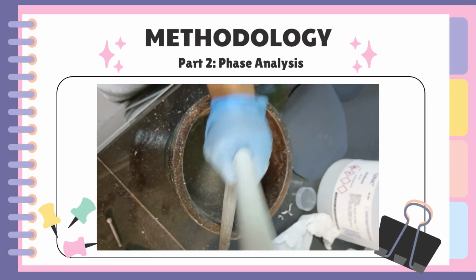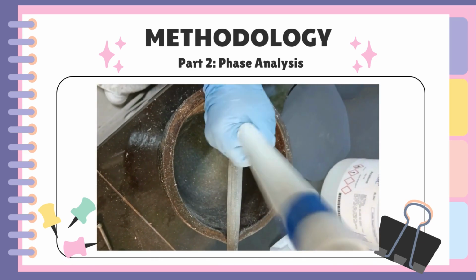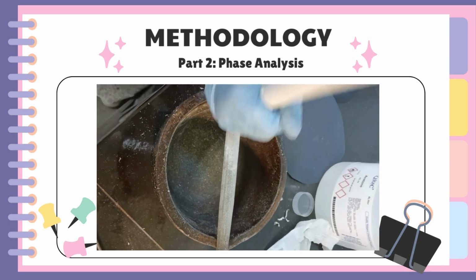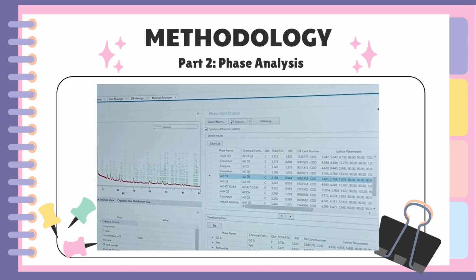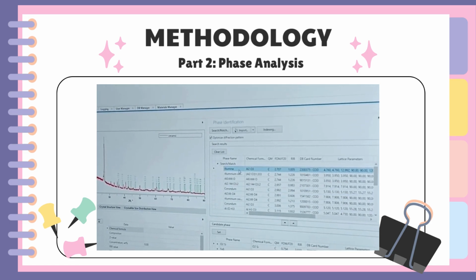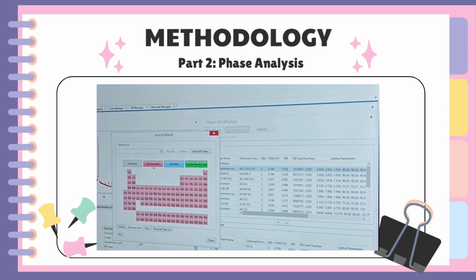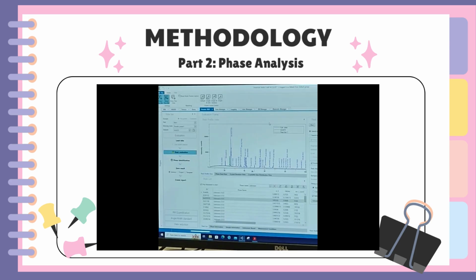Now, we move to the second part of our experiment, which is phase analysis. First, we prepare the sample in the form of powder. We grind our sample by using mortar and grinder. So this is our sample after we grind the ceramic bars. Next, we send our sample and the disk to the XRD laboratory. The function of the disk is to store our phase analysis data. Then, after that, we can plot our graph intensity versus two theta of ceramic for peak analysis. And then we get the specific composition in our sample.